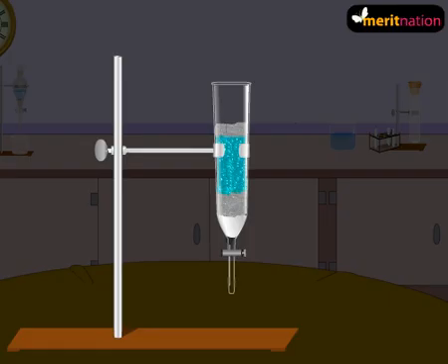The mixture to be separated is now dissolved in a highly polar solvent, which could be for example alcohol, and is introduced into the column. Now let's see what happens after some time.